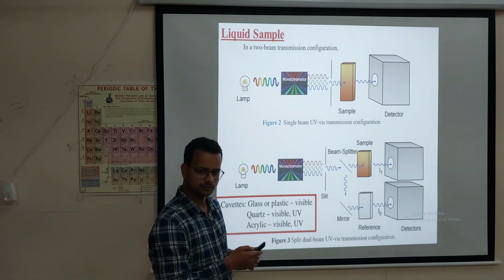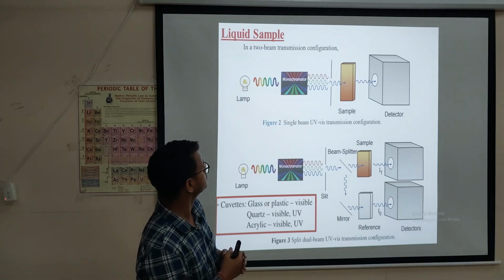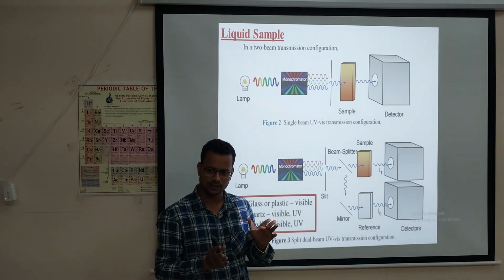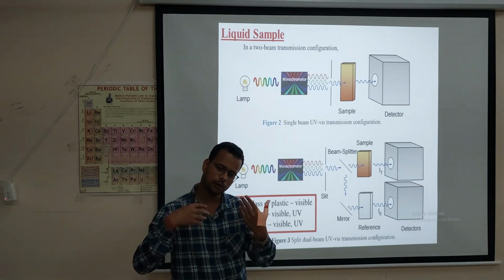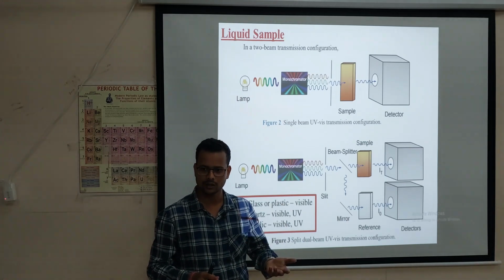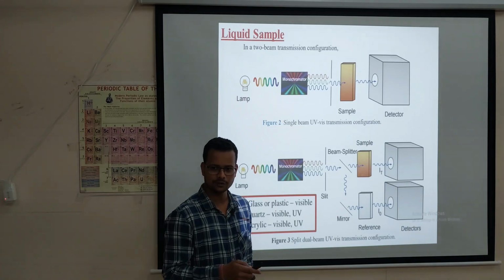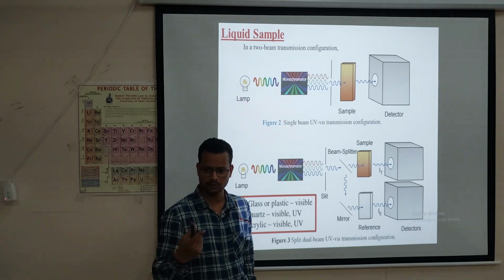Then what is the use of the monochromator? What have I told you? Your question is: if it separates light into different colors, but the slit allows every color, whether it is blue, green or yellow, then what is the use of the monochromator? We will discuss that later. What I know about the monochromator and slit is this. If this question arises, I will think about it.